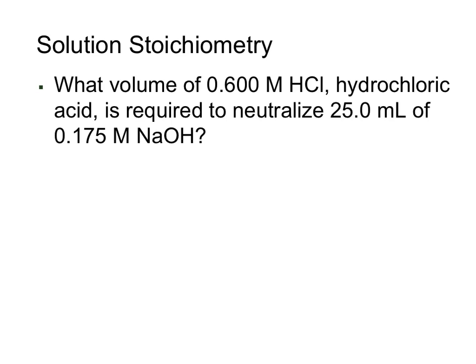In this example, we're going to look at a classic acid-base titration. Our first step is to look at our balanced chemical equation. So in this case, we have our hydrochloric acid plus our sodium hydroxide will react to give us sodium chloride and water. The most important part here for us to note, and we will use this later, is that it is a 1-to-1 stoichiometric ratio between our hydrochloric acid and our sodium hydroxide.